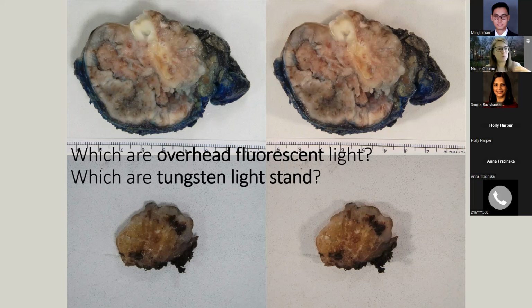And so maybe one specimen looks better with a little bit of a cool tone, and maybe one specimen looks better with a little bit of a warm tone. And I've literally chosen pictures differently based on these two settings for what I think is more appropriate for that specimen. The other thing that you'll notice, you guys were talking earlier about the shadows.